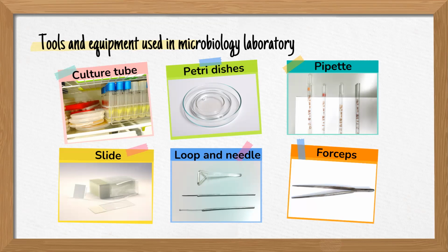Forceps is the tool that you normally use to take sample or some small tool for experiment. The forceps should be flamed or sterilized before use. But prior to flaming the forceps, you may need to dip the forceps into 95% alcohol and then flame.